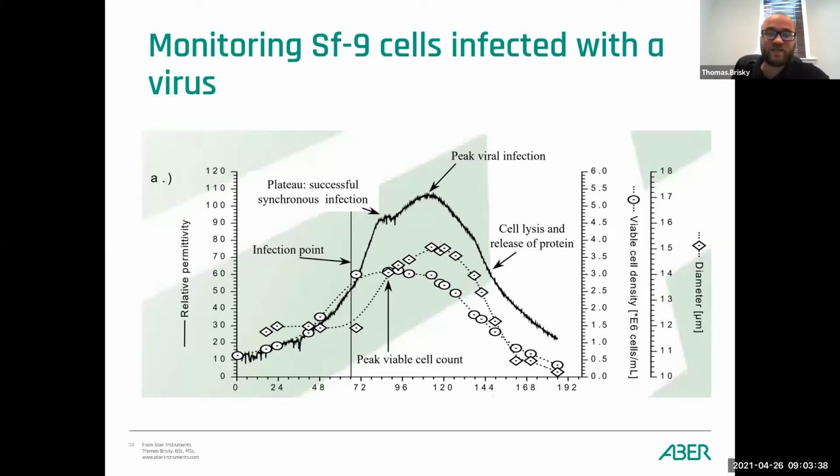And of course, because of the detail in the complete capacitance profile, you can also determine peak viral infection and when the cells start lysing upon release of the protein. So essentially, capacitance represents the live biovolume, which allows for a full understanding of this process.